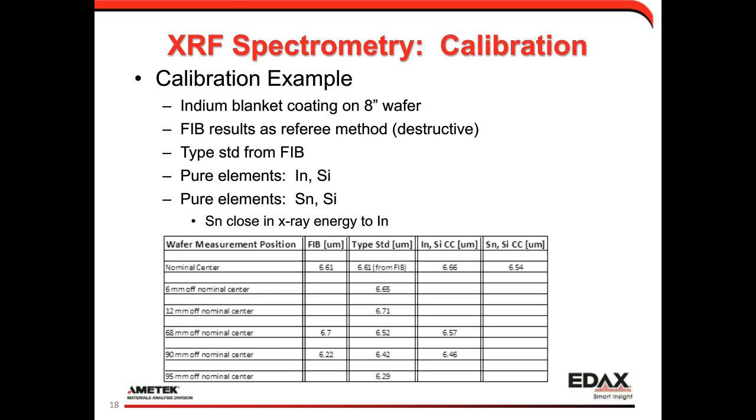What I noticed when we were looking at the wafer in the focused ion beam microscope is that you can see topography in the coating thickness, because this layer is getting thick enough that we're forming crystal grain structure in the indium. And depending on which crystal grain you're looking at, there's a variation in the thickness.